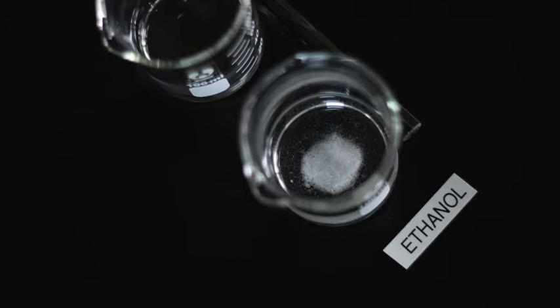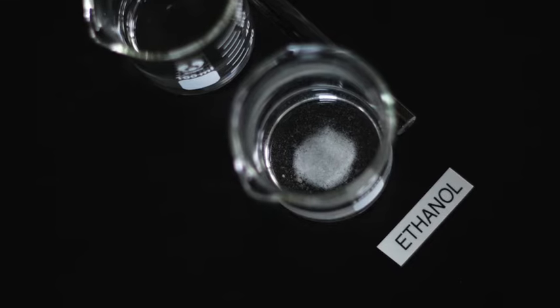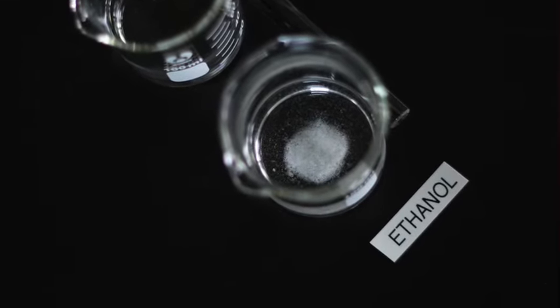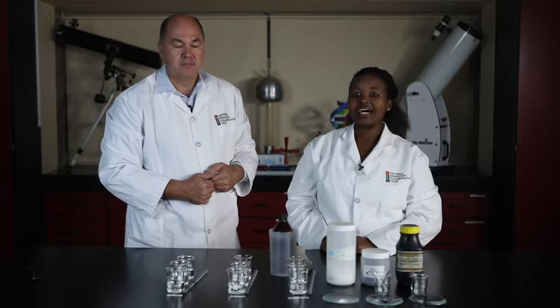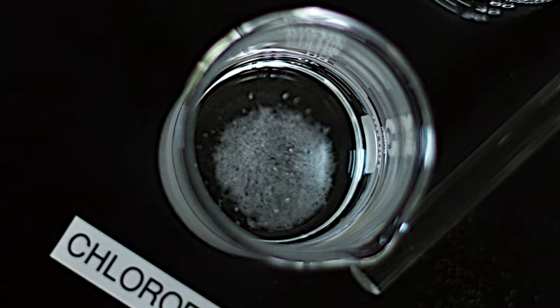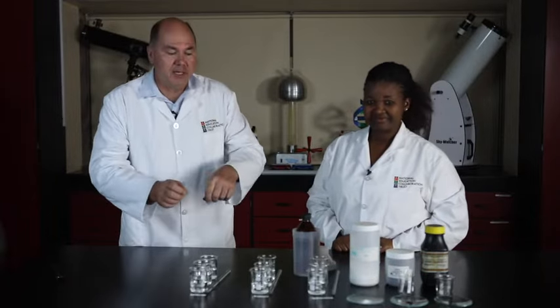Here is the result for sodium chloride added to ethanol. Describe what you see in the beaker. Write your description in the table. And now we move on to the last solvent, chloroform and sodium chloride. Take a good look at it and write down your observation in the table. We're now going to remove this set of beakers from the desk.